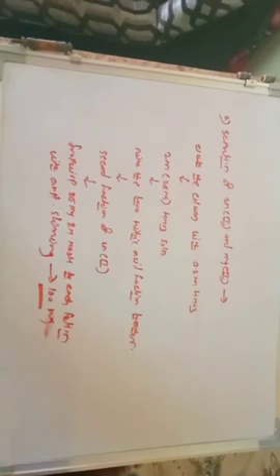After that you can determine the amount of both zinc and magnesium by titration with EDTA. We are very much familiar with this procedure: you take the solution, add buffer solution, add Eriochrome Black T indicator, and titrate with ethylenediaminetetraacetic acid until the wine red color changes to blue.